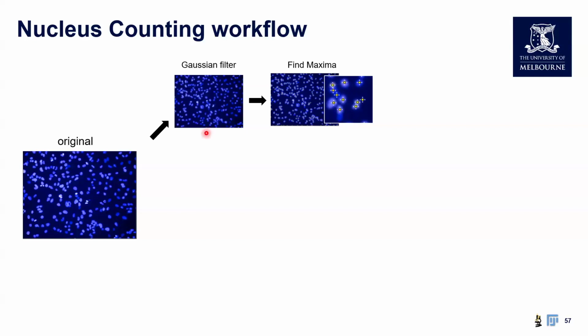You might have noticed that these measurements can be done even without any object detection, but it only works if the structure has only one bright point per structure. It's a simple method, but can be used only in certain cases.